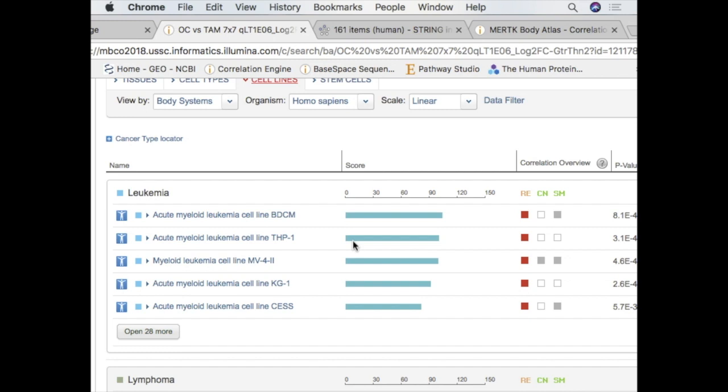Yeah? Does this just do a two-way comparison, or can you do more? Because we're just comparing two groups, right? There's just differential expression of one group over another group. Right. But if you had a bunch of different cell types and they all had different differentially expressed genes relative to others, would this be able to handle that and tease it out? What you would do is, say you had a combination of cell types.